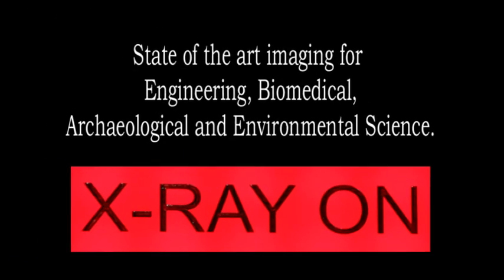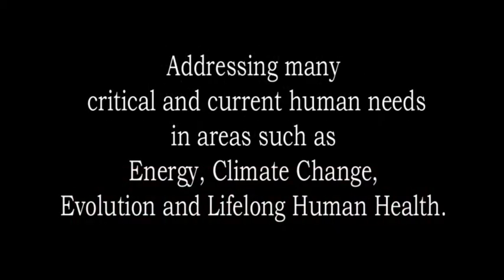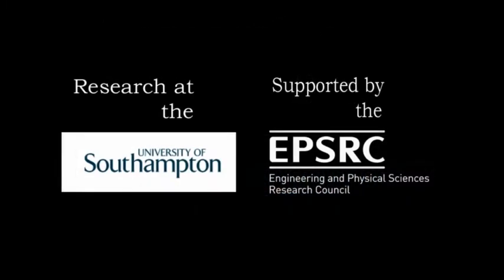Three-dimensional X-ray vision is no longer just the domain of fictional characters like Superman. For Professor Ian Sinclair and his team at the University of Southampton, it's all in a day's work. Using something called computer tomography, they could find themselves doing anything from gazing into the jaws of an enormous fossilised sea creature to looking at the less appealing intricacies of a landfill site.